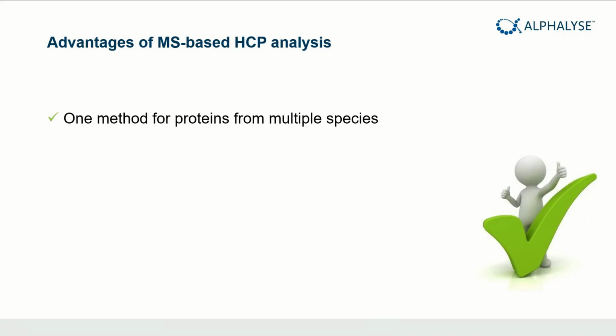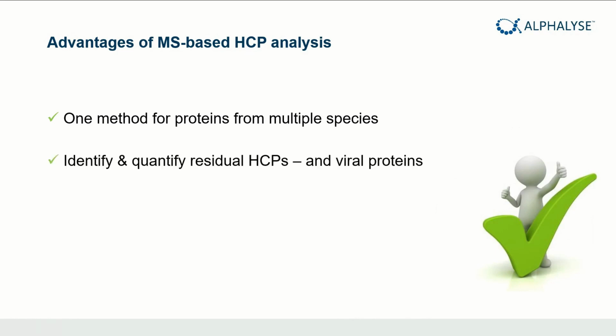Here I have shown you that we have one generic method that works for proteins from multiple different species and multiple different purification steps and buffers. The method can identify and quantify each residual protein and also the total amount. Even viral proteins can be identified and quantified.